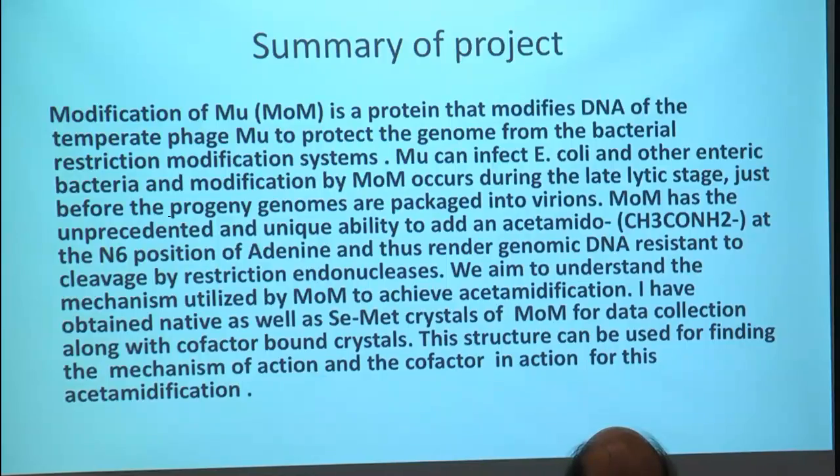So I got the structure of this particular protein. I got the crystal, it diffracted to around 1.5 angstrom, and before that we couldn't solve it, but now we got the selenomethionine crystals and we could solve it. But the major question is, what is the cofactor that is acting? We don't know, whatever structure we have doesn't have any cofactors. So I started by soaking with coenzyme A.